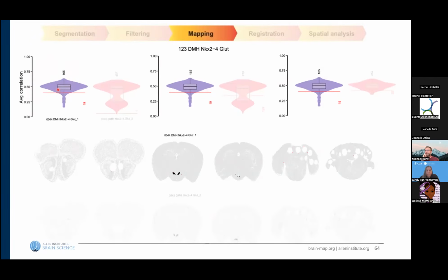What we calculate is the median absolute deviation in both directions, for the upper and the lower one. And then we take 2 times the lower median absolute deviation and set that as a threshold. So in this case, you have this example of this hypothalamic cell type. We now set the threshold here. We filter out 19 cells.